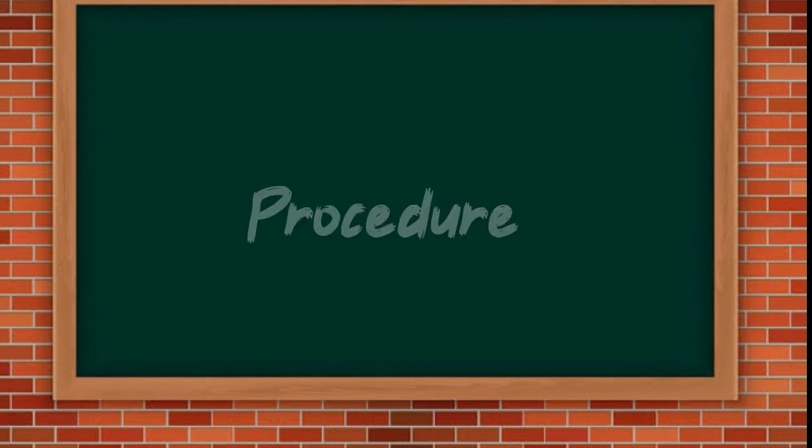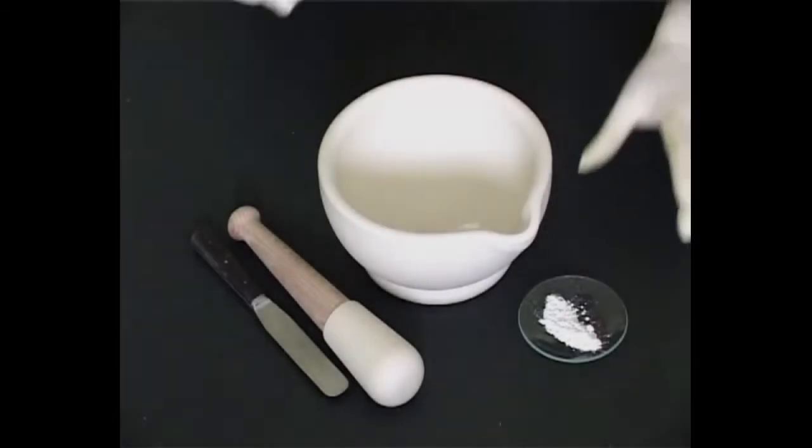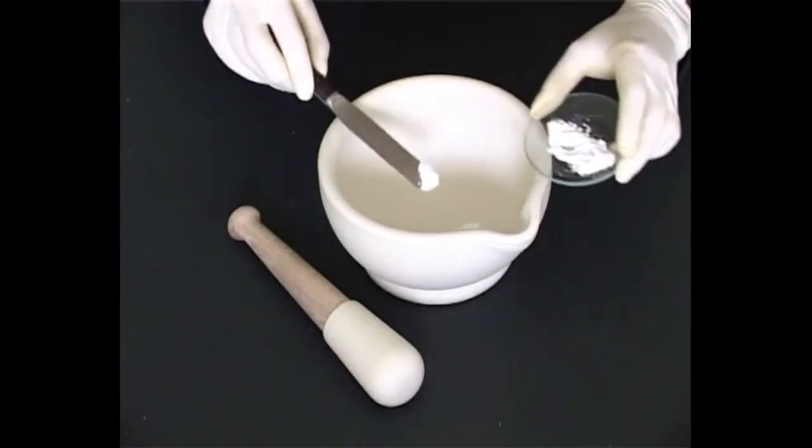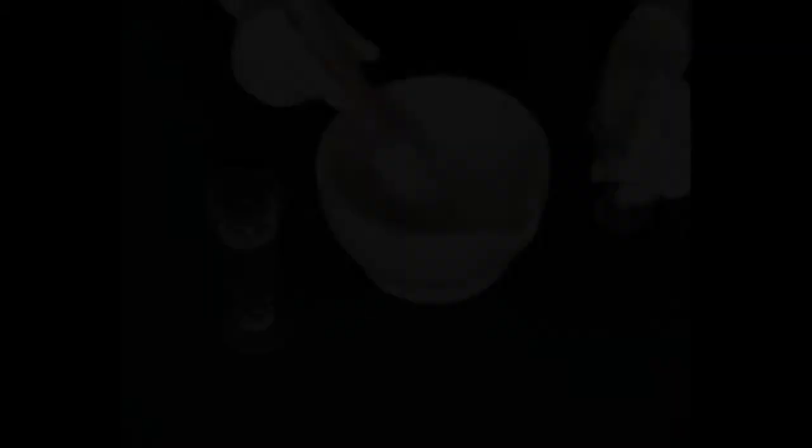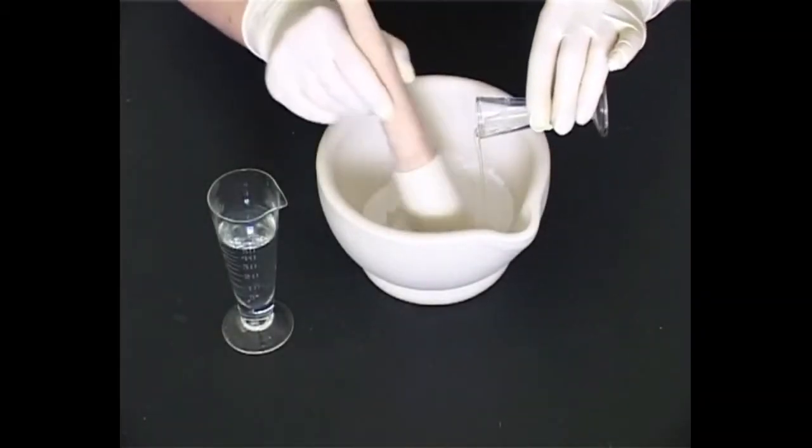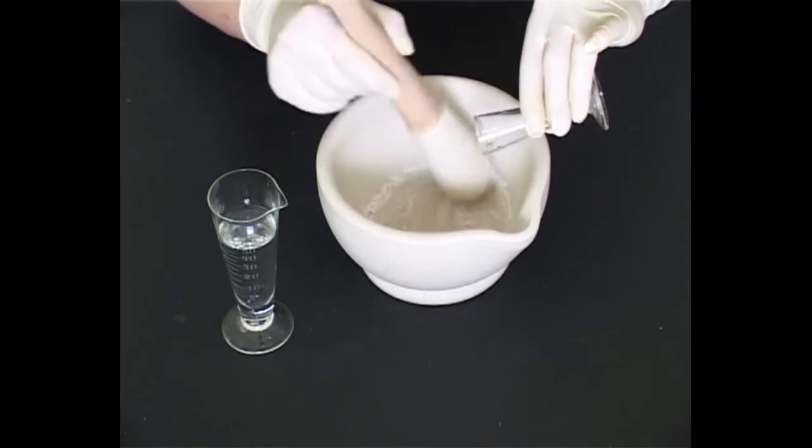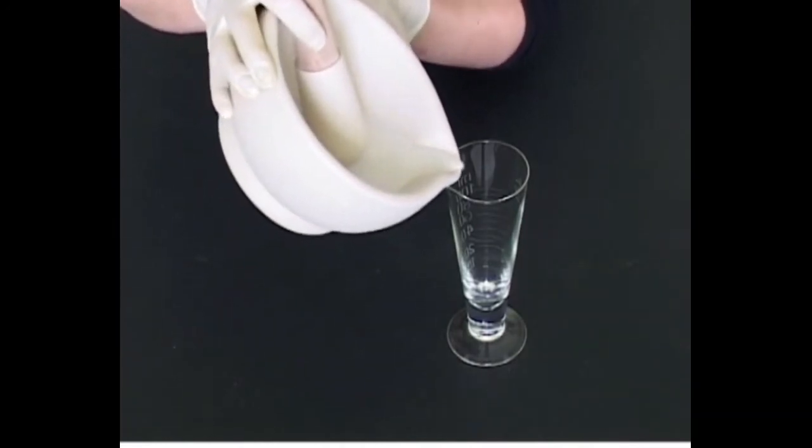Procedure: Take a mortar and add 500 mg of gum to it. Pour a few drops of distilled water and pestle the gum into a fine paste. Transfer the smooth paste to a 50 ml beaker.